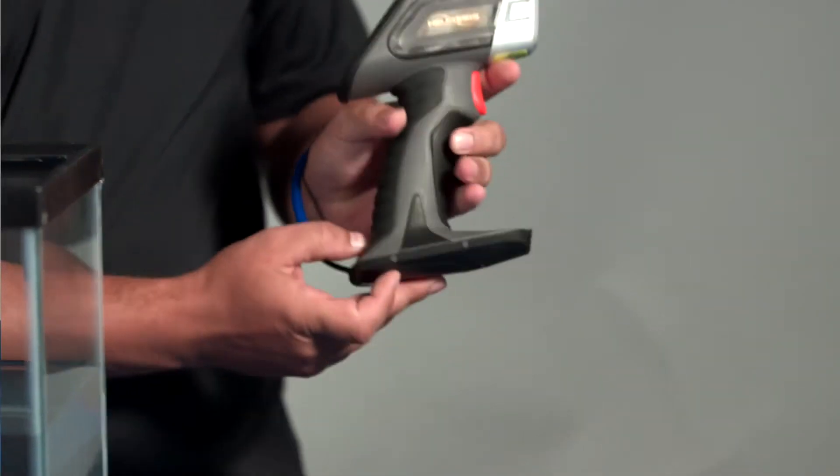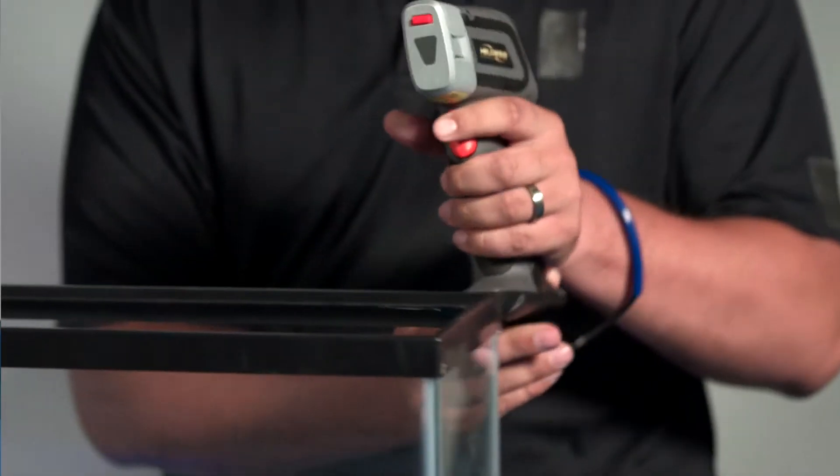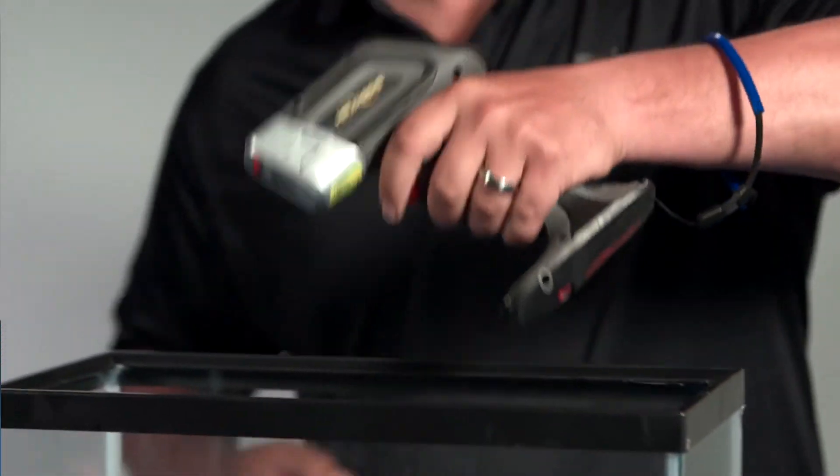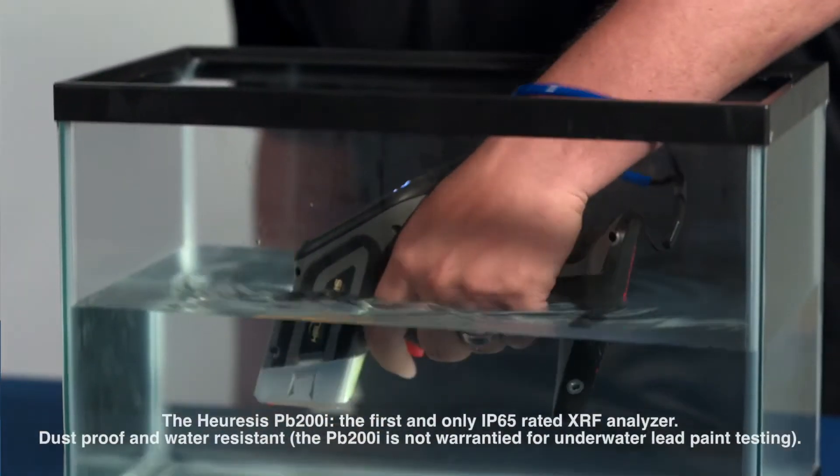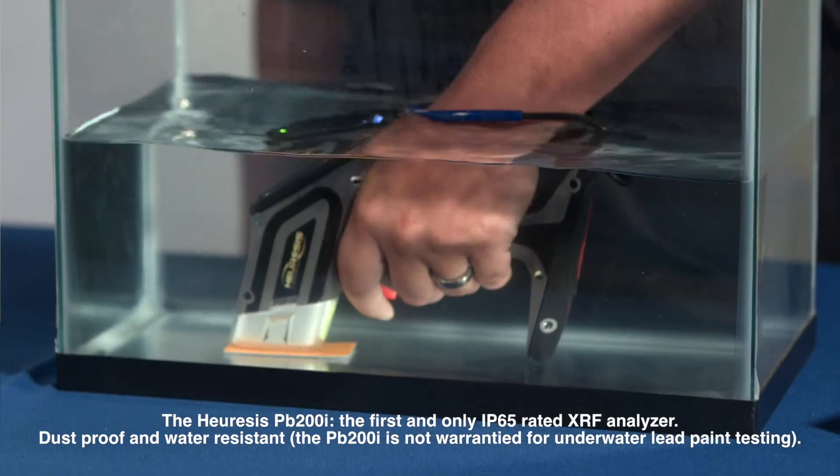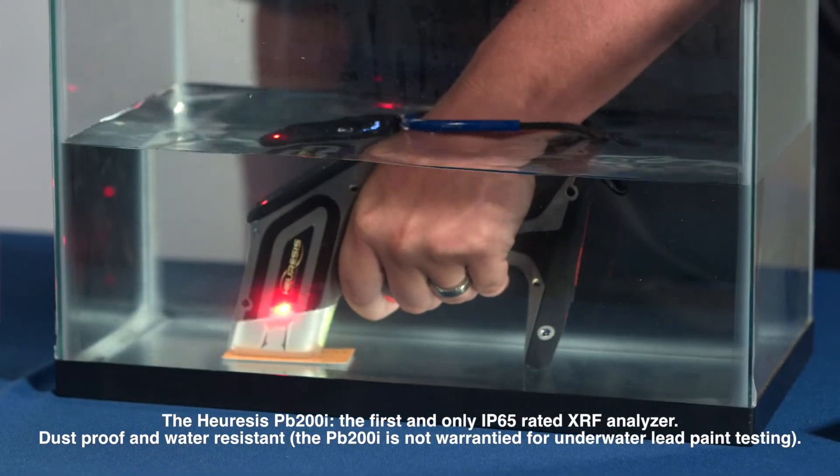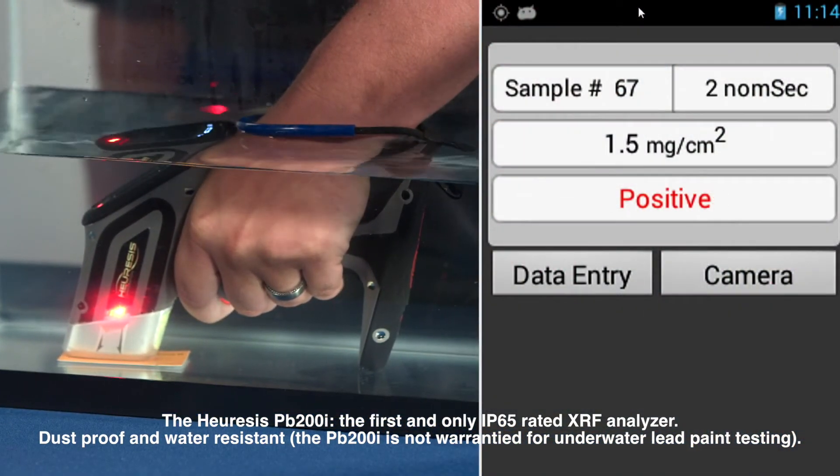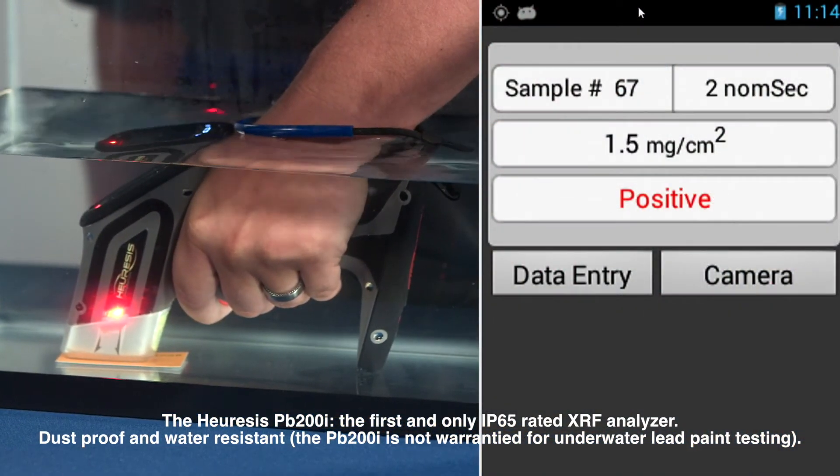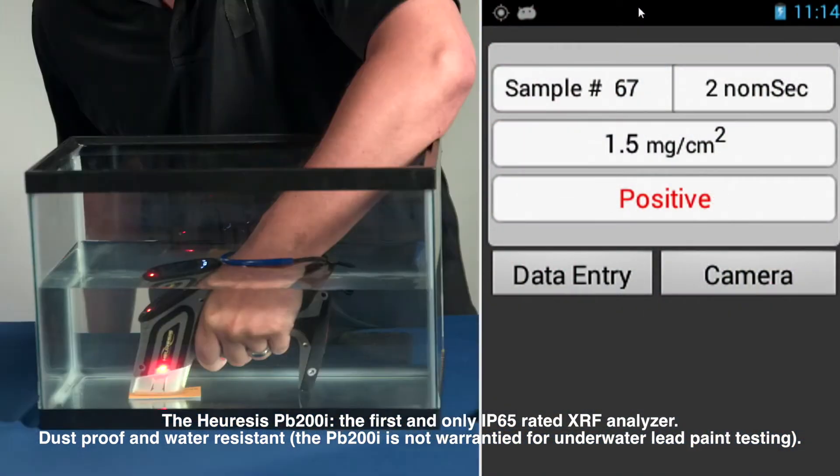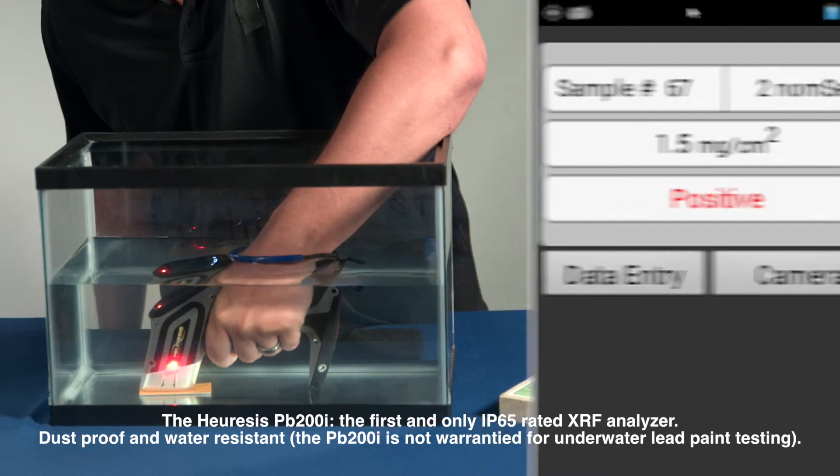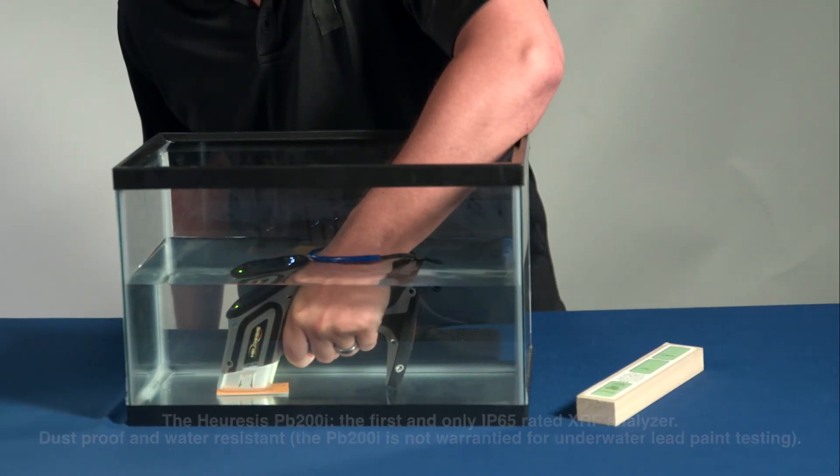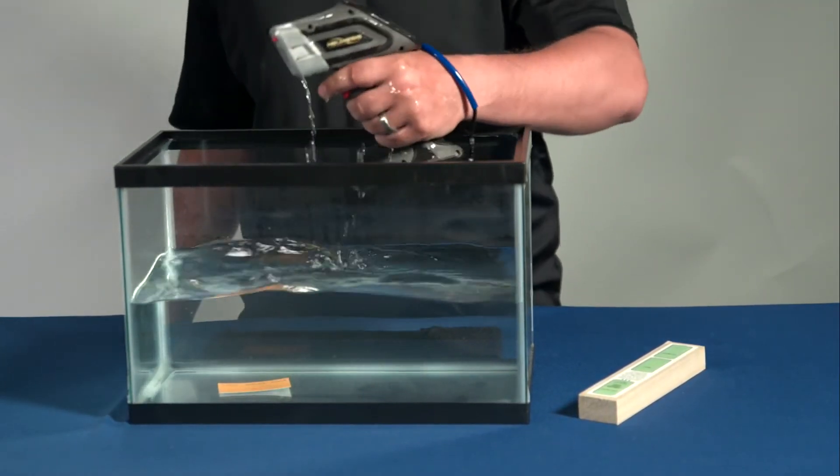Now we'll go ahead and immerse it into the fish tank and take one more reading. The PB200i is highly water resistant.